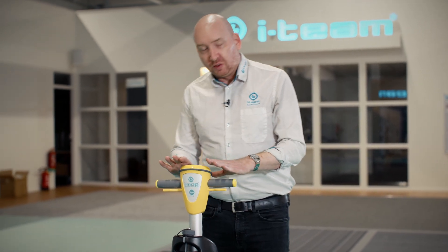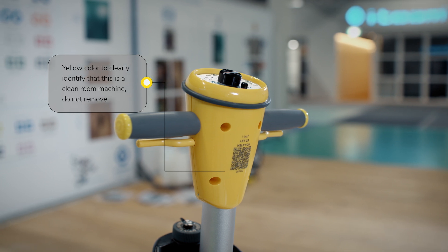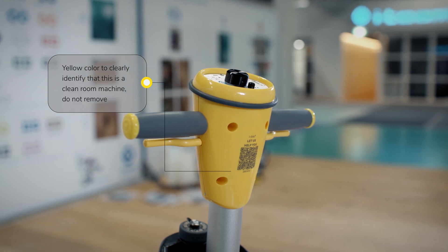Starting at the top, you'll notice that the color is different. We have a yellow color to indicate that this is a special machine specifically for clean rooms and not to be removed.